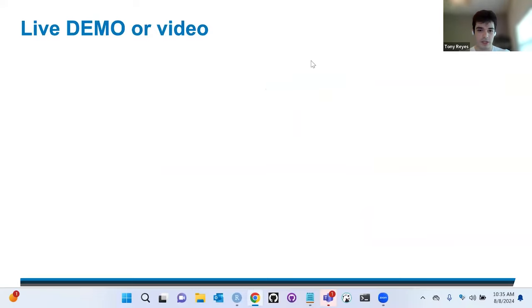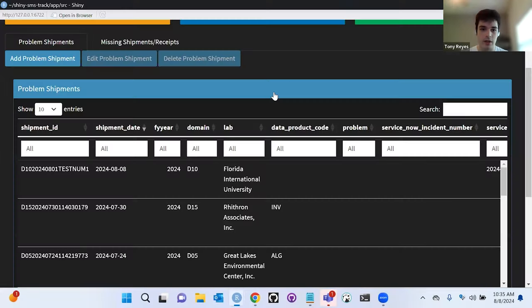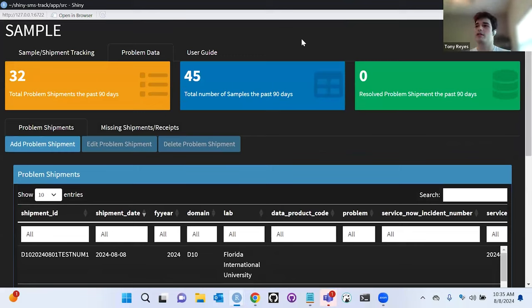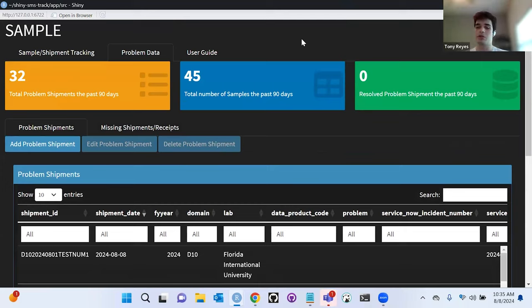Live demo time — I will go into the app very quickly. This is the dashboard of the application. Here at the top, you get three value boxes: for the past 90 days, how many problem shipments were there, how many problem samples were there, as well as how many problems were solved.